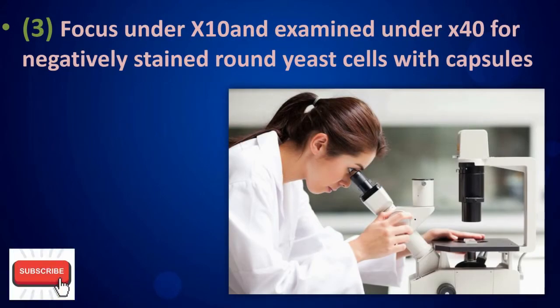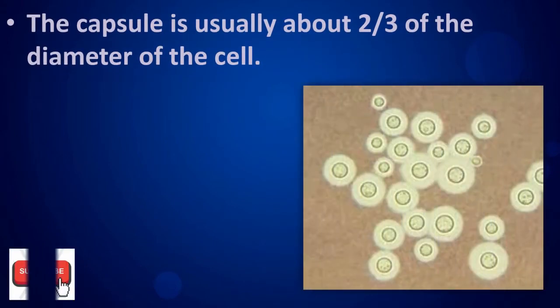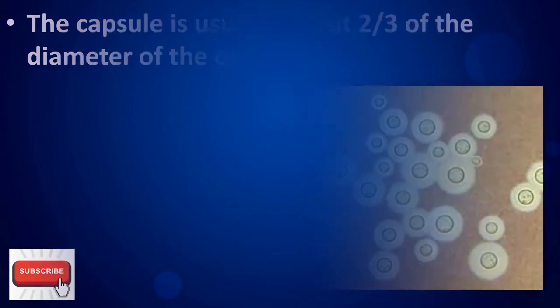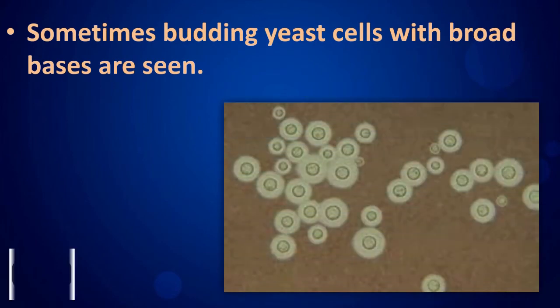Examine under the 40x objective for negatively stained round yeast cells with capsules. The capsule is usually about two-thirds of the diameter of the cell. Sometimes budding yeast cells with broad bases are seen.